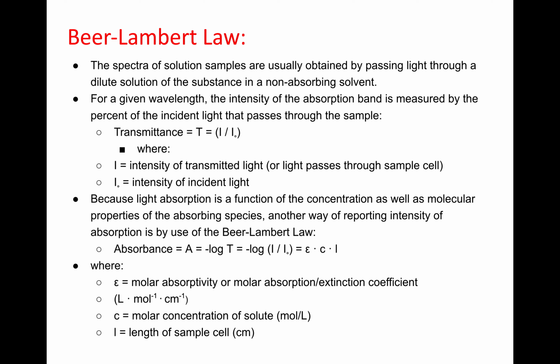And the molar absorptivity or extinction coefficient of the species. Okay, that's basically a constant. Okay, so we have absorbance is equal to epsilon times the concentration times length. Okay, so you look at your data. I'll show you it in the next slide. You get the absorbance. In the manual, I have the molar absorptivity, and I have the path length. It's 1 centimeter. If I didn't put that, it's 1 centimeter. Okay, so then you just solve for the concentration in your sample.